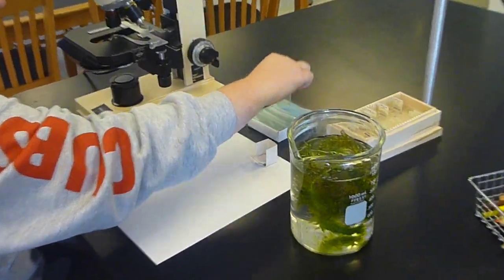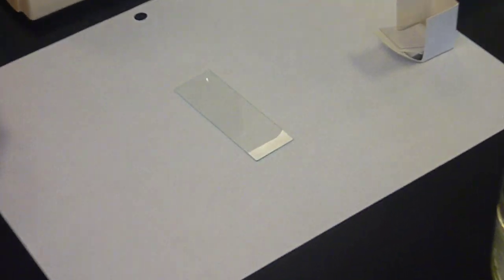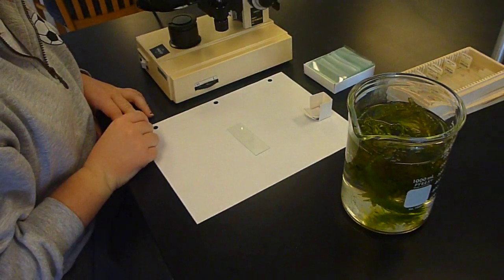So sometimes in the lab, the slides that we're considering are not pre-made or prepared slides. Sometimes you have to make your own slide. It's sometimes referred to as a wet mount.